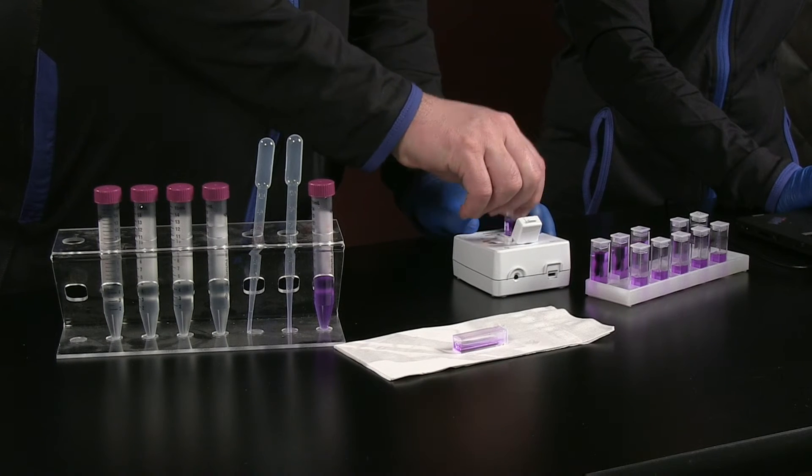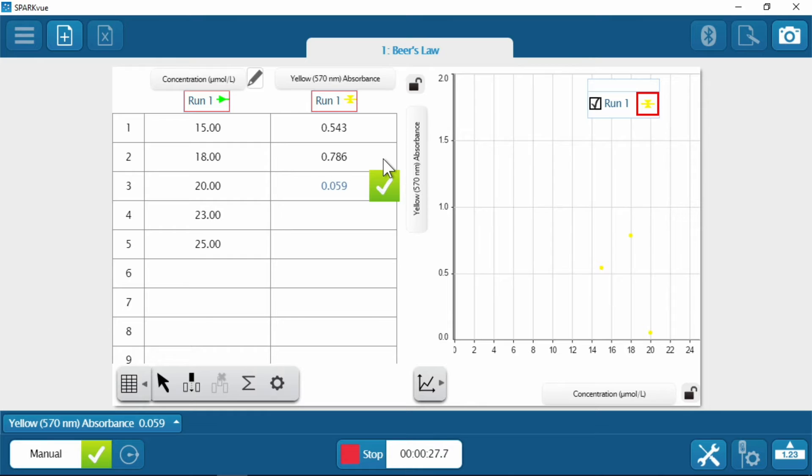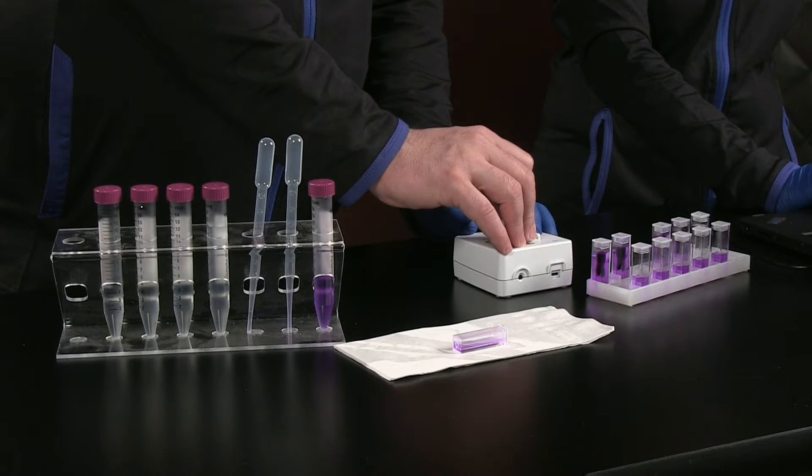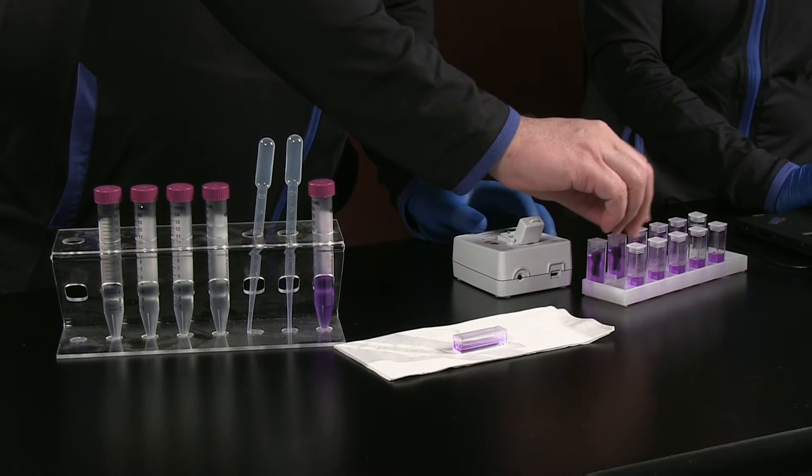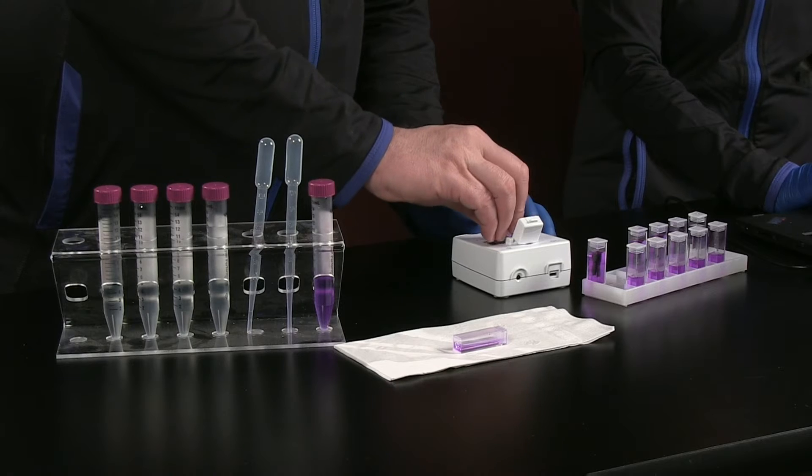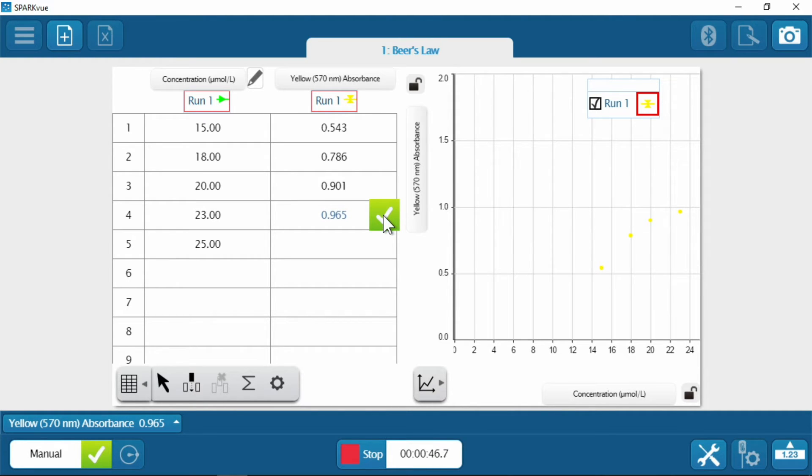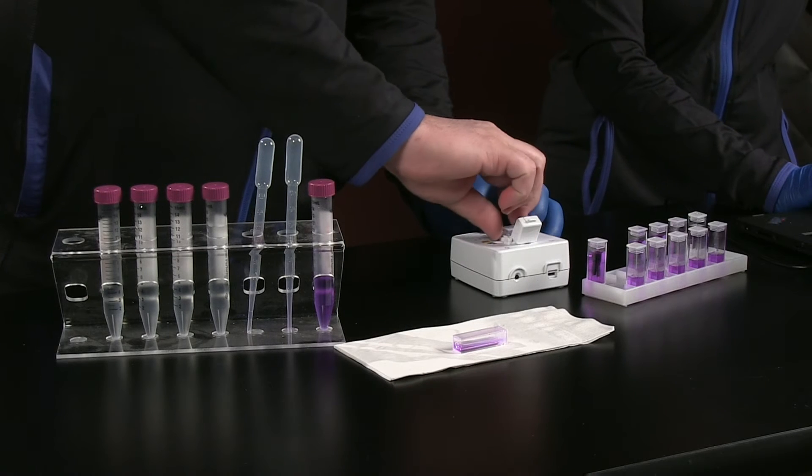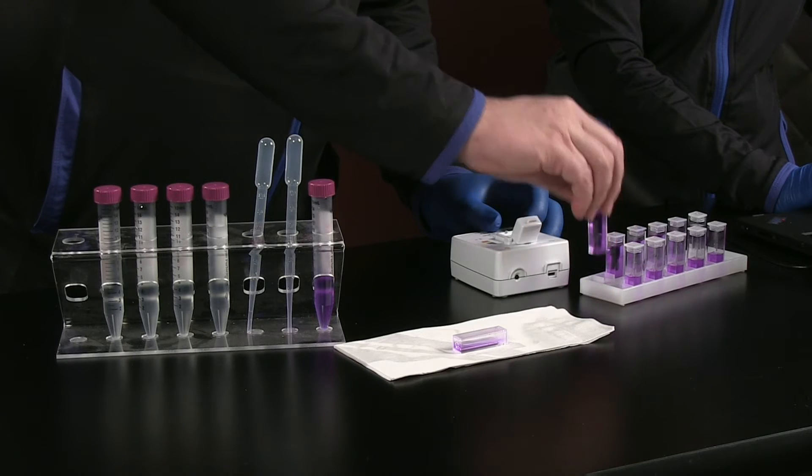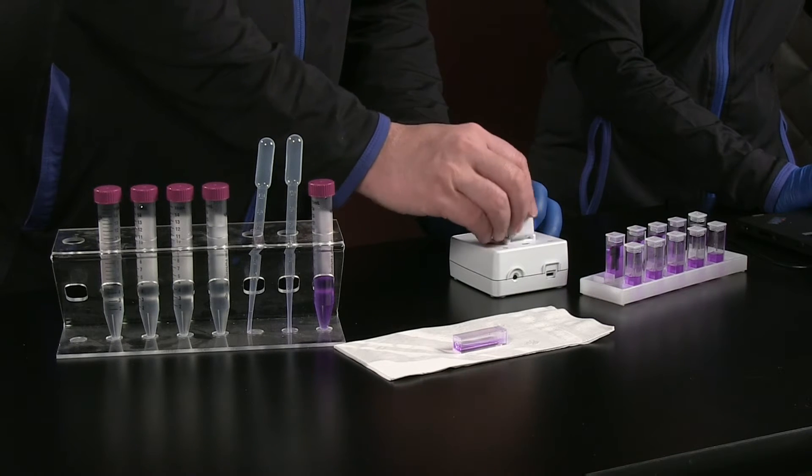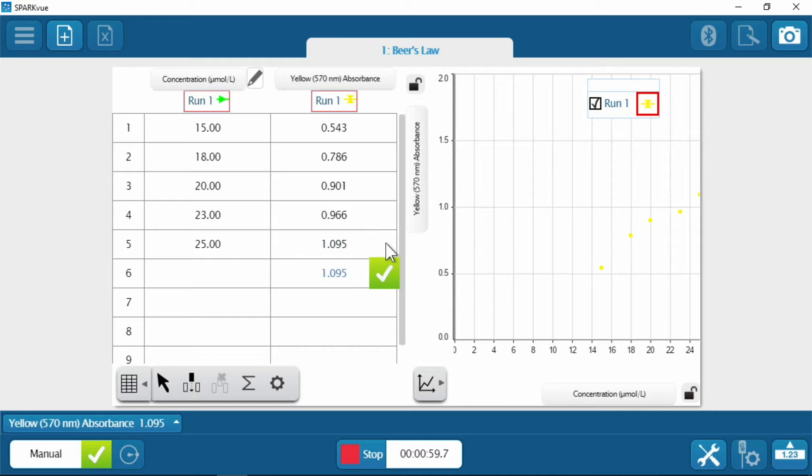Let's try the next one. You can see the dots showing up on the right side there of the graph. Okay, here's the 20 micromolar. Okay, there's the 21, 23, 23 micromolar. And the final 25 micromolar solution. Perfect.